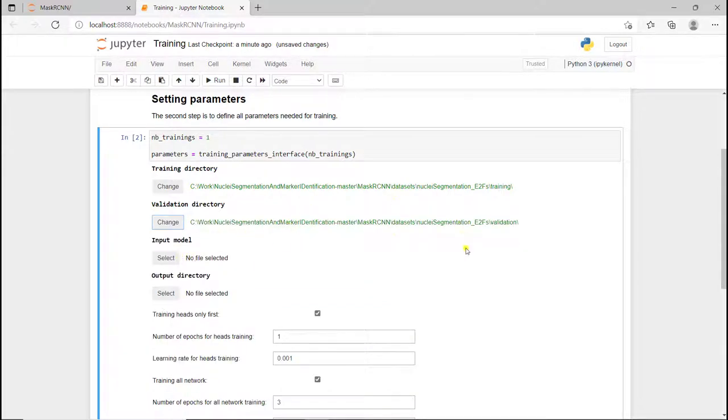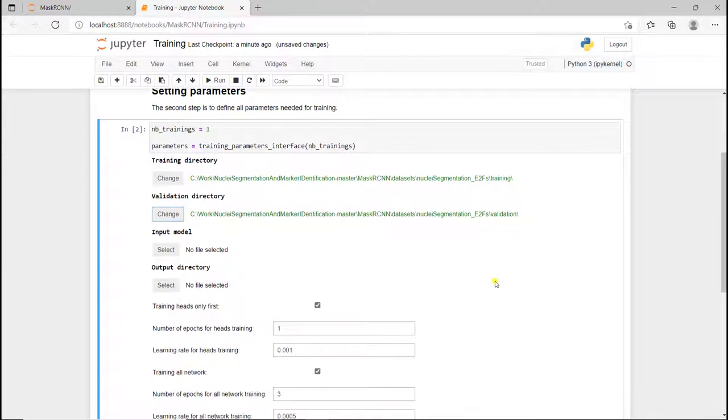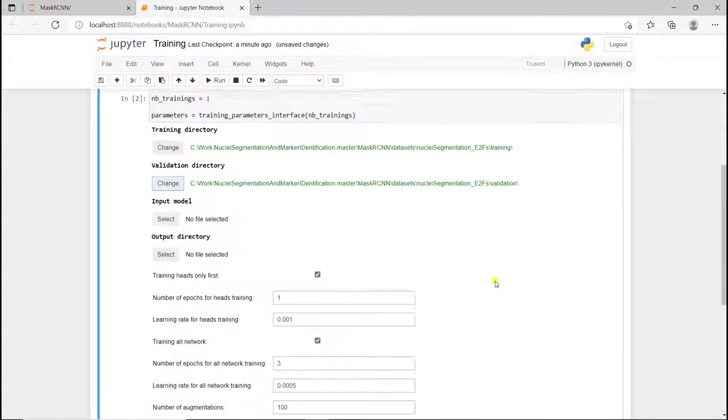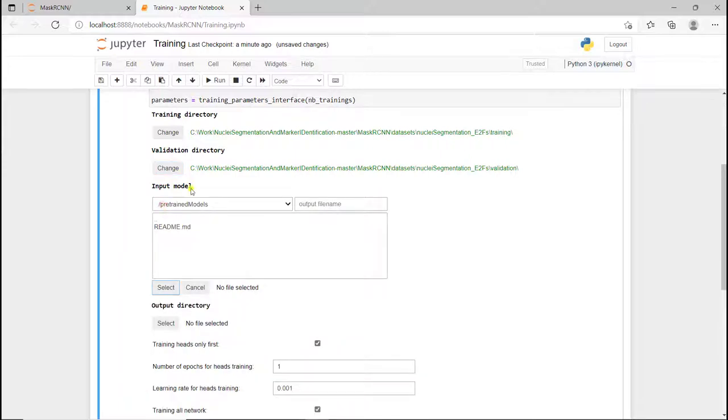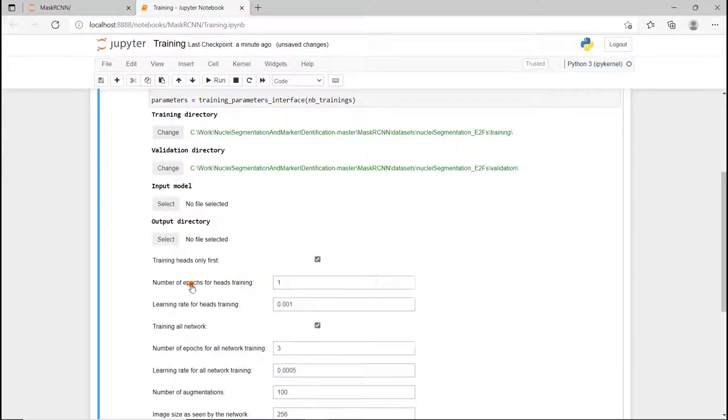Here we use a pre-trained model, a Mask R-CNN model that has been trained with the COCO dataset. If I go in the input model in the pre-trained model, I don't have any pre-trained model. So I need to get one.